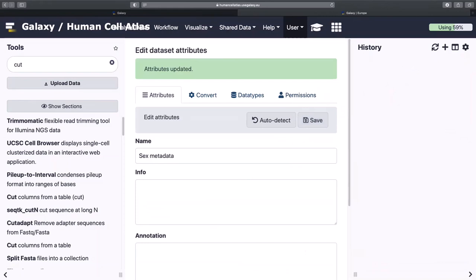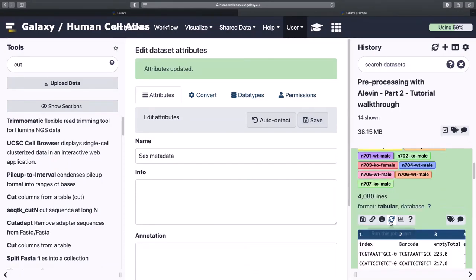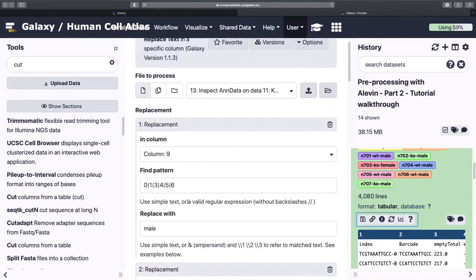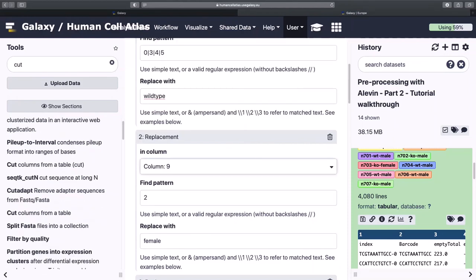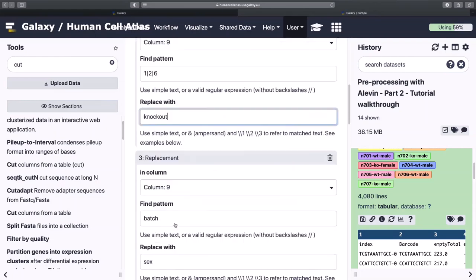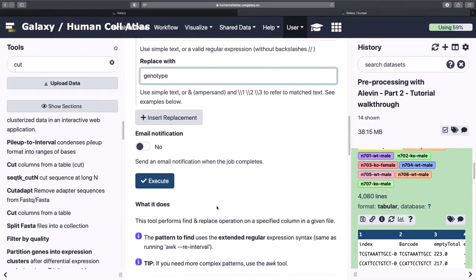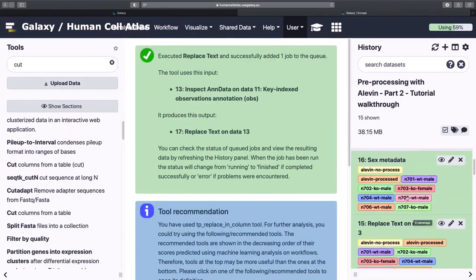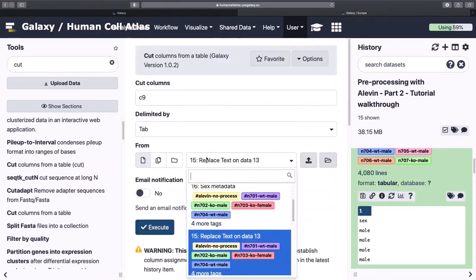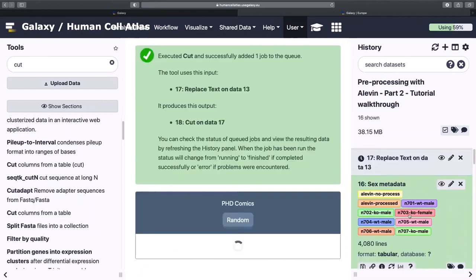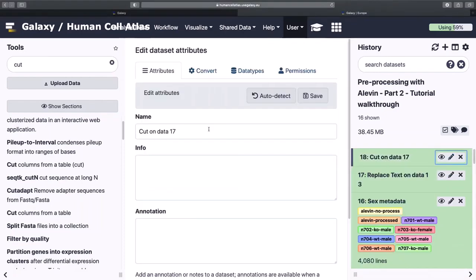And now we're going to do everything again, but we're going to label them by genotype instead. So let's do this again. We're going to switch it, and it's going to be 0, 3, 4, 5, and you're going to be wild type. 1, 2, 6, knockout. And then we're going to be calling this genotype. And then now we can call that our genotype data metadata.